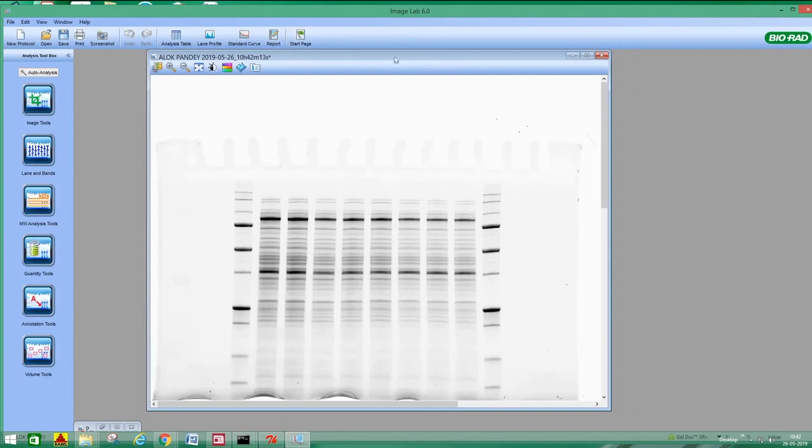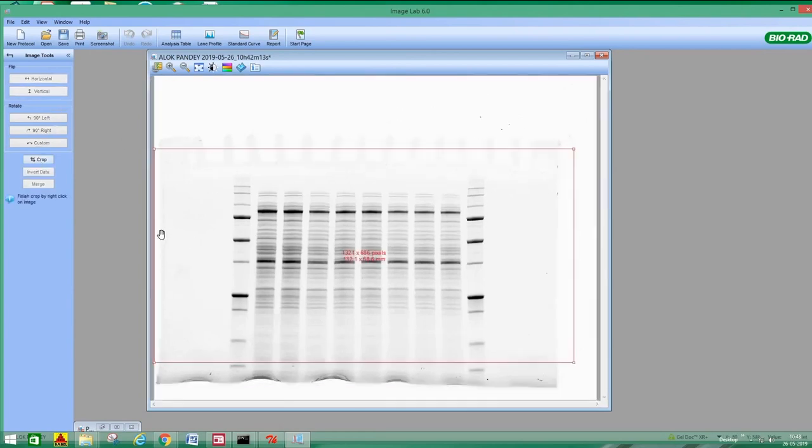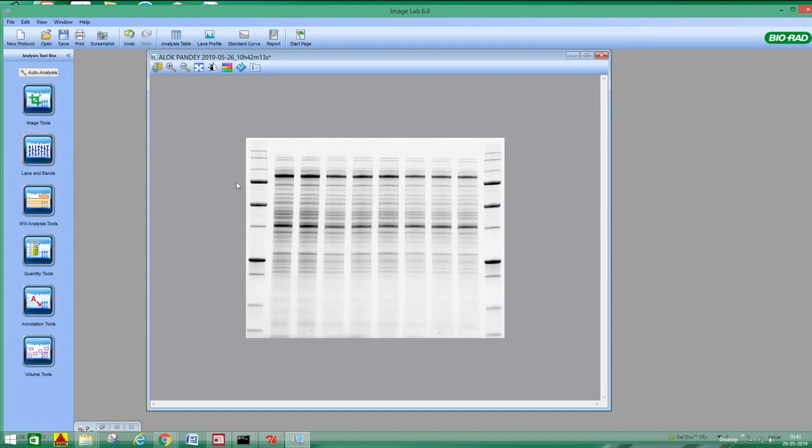First, after getting the image, or you can open any ImageLab .scn file from the instrument. Go to the left side top panel, where you can see image tools. If you go there, there are different options. You don't want to see the complete picture, so you can crop the image like this. Just say crop. So this is the cropped image, and go back here.